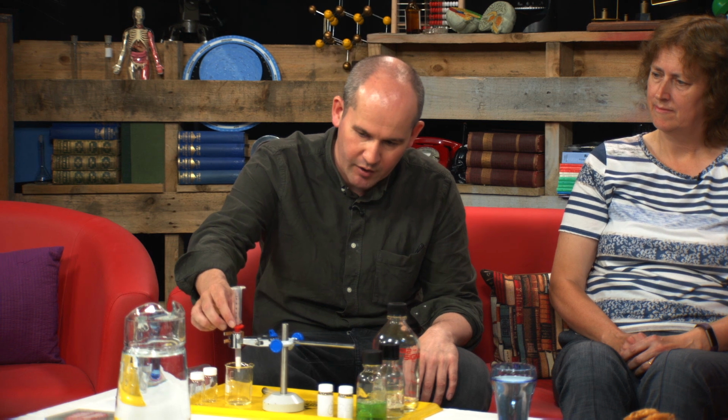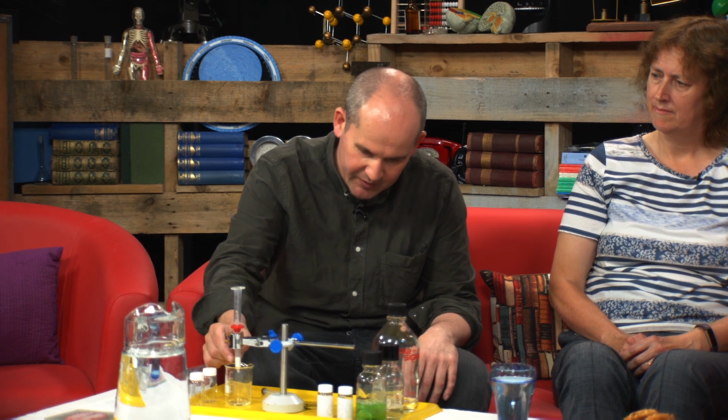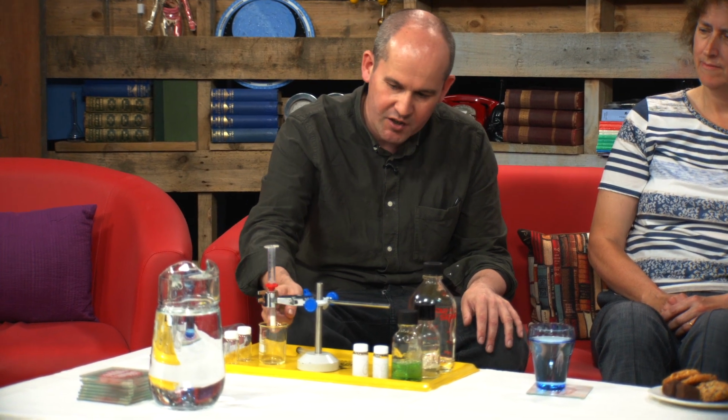So, are you going to show us some chromatography and explain how it all happens? I sure am. This is a demonstration we do in one of these labcasts, and it's really just to give us a sense of how the technique works. What we have here is a syringe, which I've plonked into the top of what's called an SPE cartridge. The key thing is that this is white solid column packing material, and that's the stuff that's going to do the work.